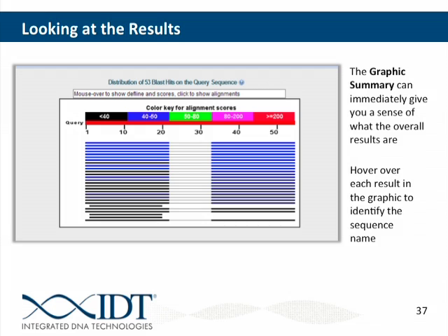And then we can look at the genomic sequences to make sure that it's only hitting a single chromosome. If our assay is going to be highly specific, it should hit one chromosome. You can see here we're hitting several different chromosomes. So we need to look at each of these to see what might be going on. You can ignore the alternate chromosome assemblies and just focus on these primary assemblies here.